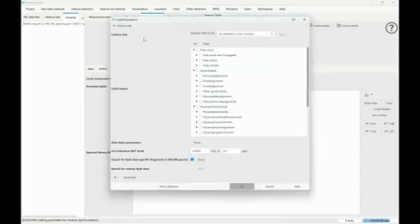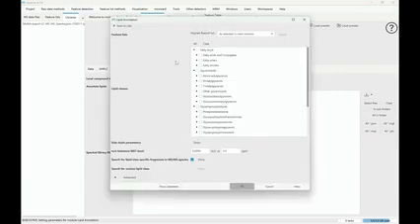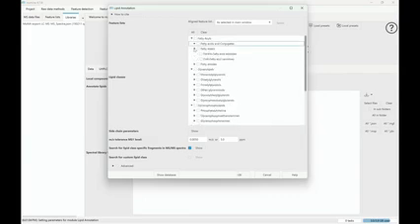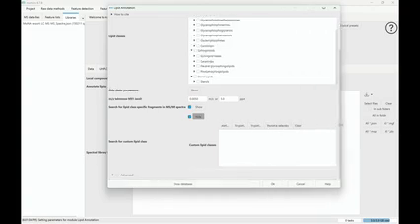Yeah, so there is the annotation. So again, I just go search lipid. You're also going to see there's a lipid annotation summary, there's a lipid ECN equivalent carbon number plot, so there's a couple of lipid-specific tools. But then in this parameter dialog, first of all, there are the different groups, and the different rules and so on are defined in mzmine. But if you want to define new rules, you can actually also search for custom lipid classes. So you can open this, and then in here, define your custom lipid classes and rules like fragmentation and head group losses and so on.